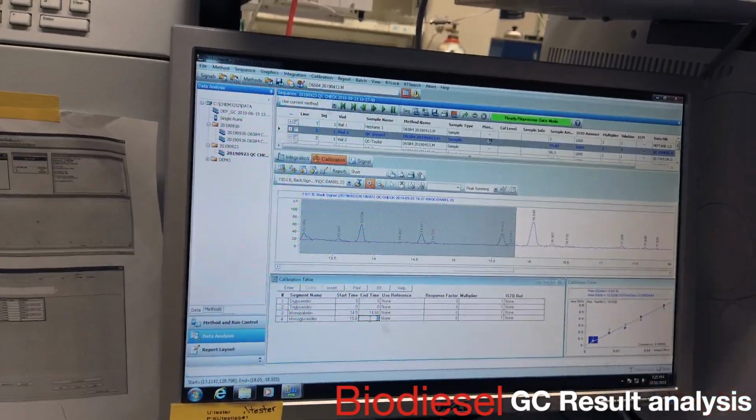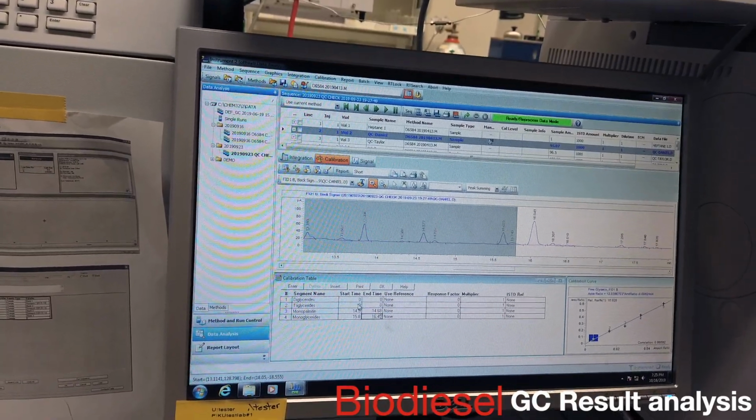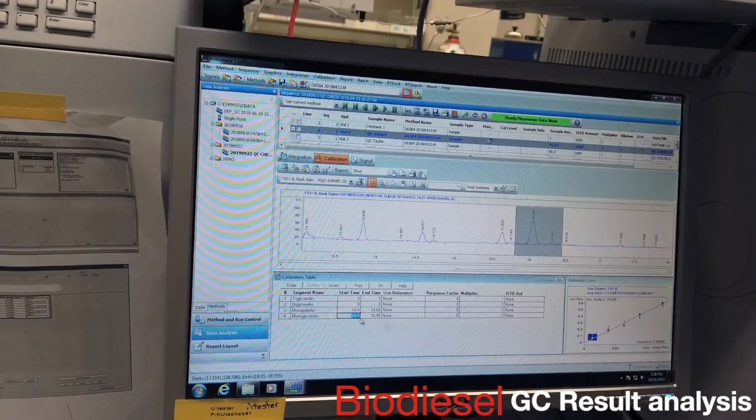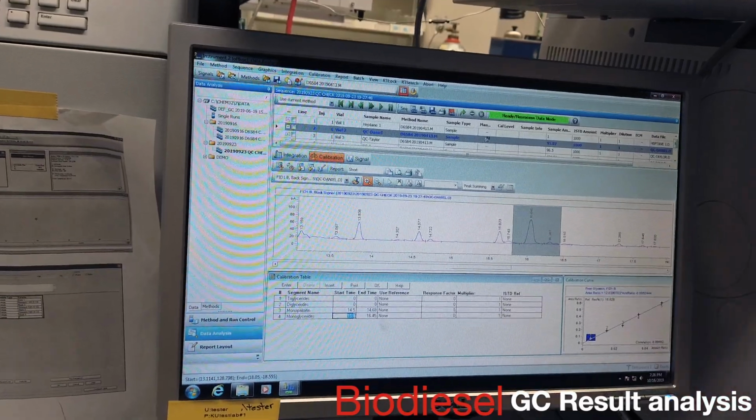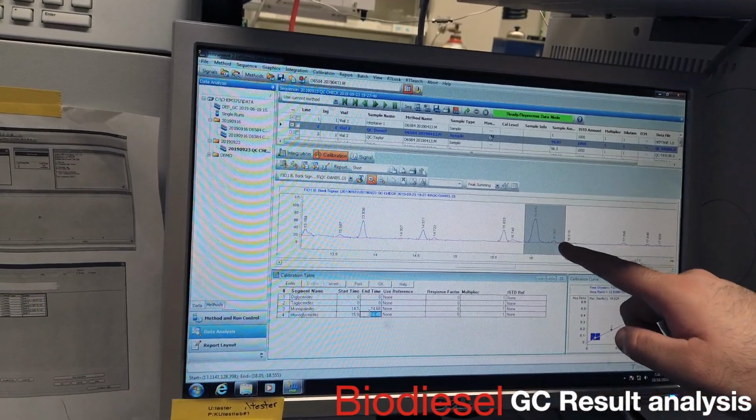To 16.45. So this is just important to check every time that you do it because it could shift. So I overdid it, for instance, so I'm going to update that to 15.9 because it's going to add everything that's in this window.